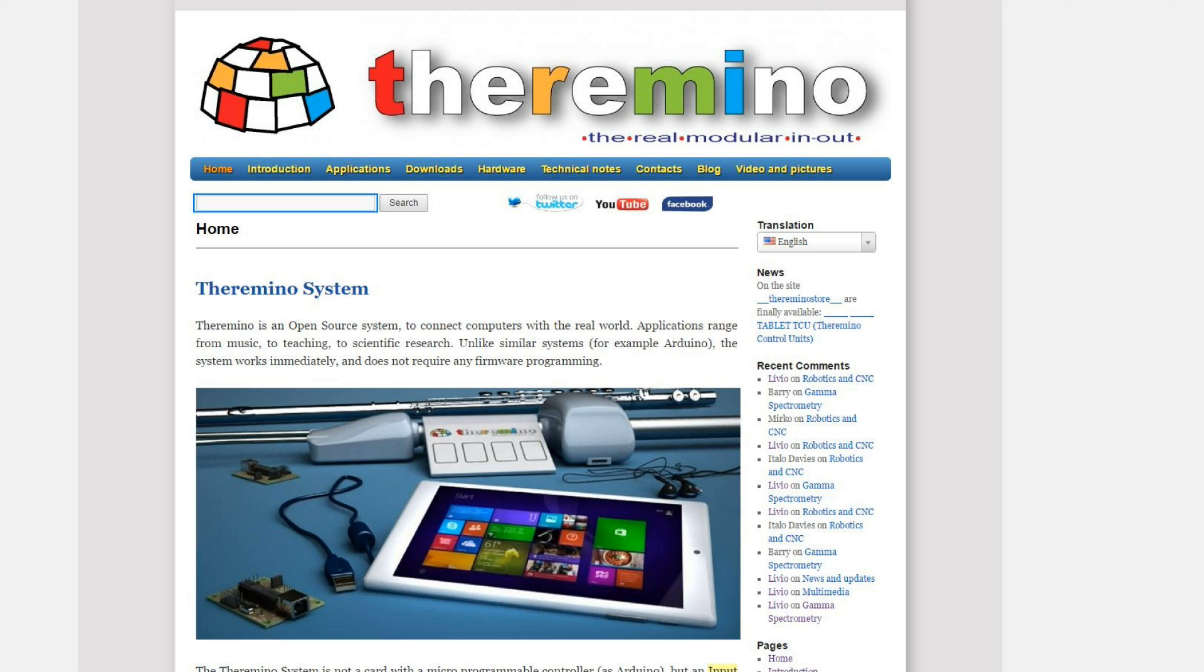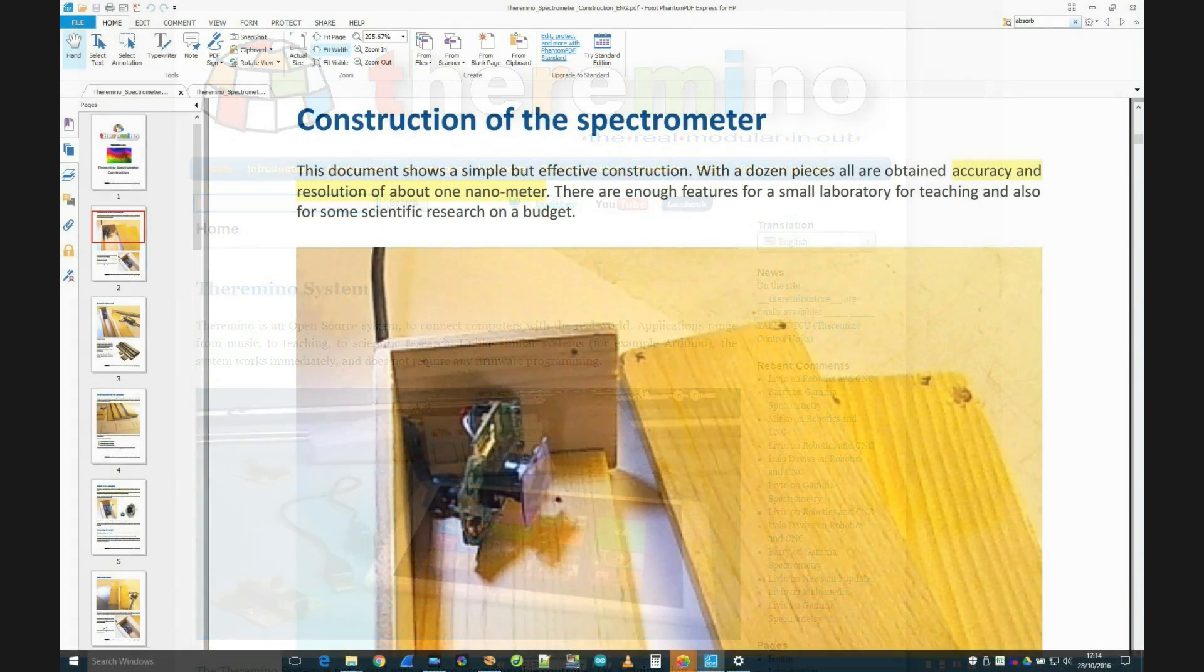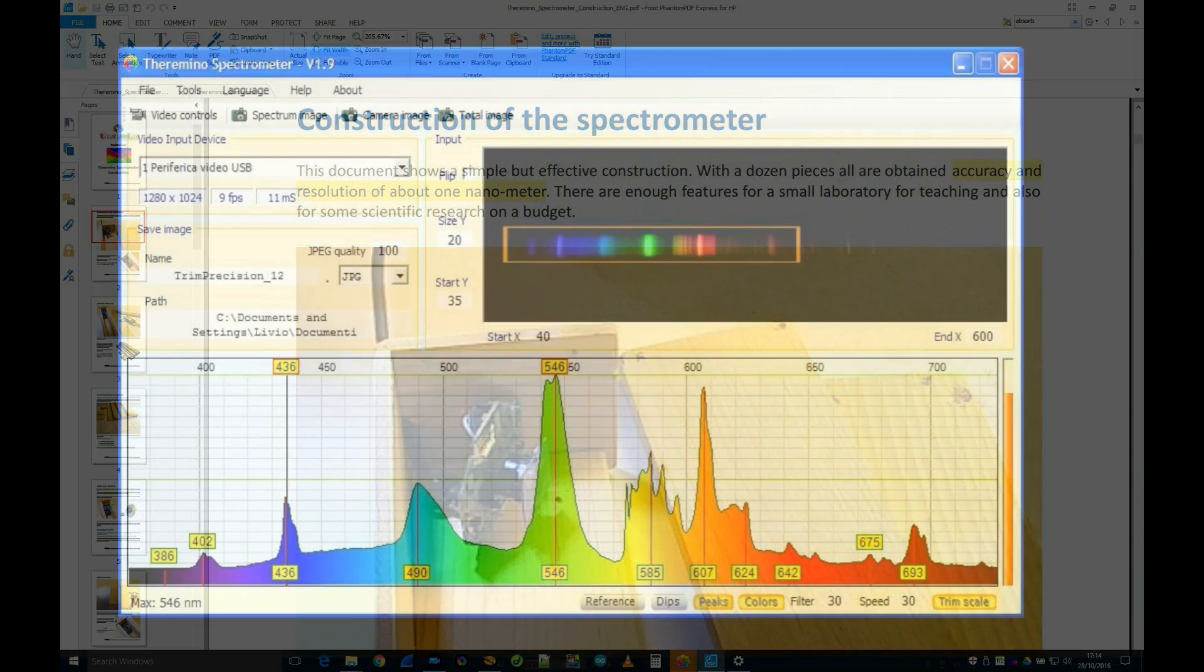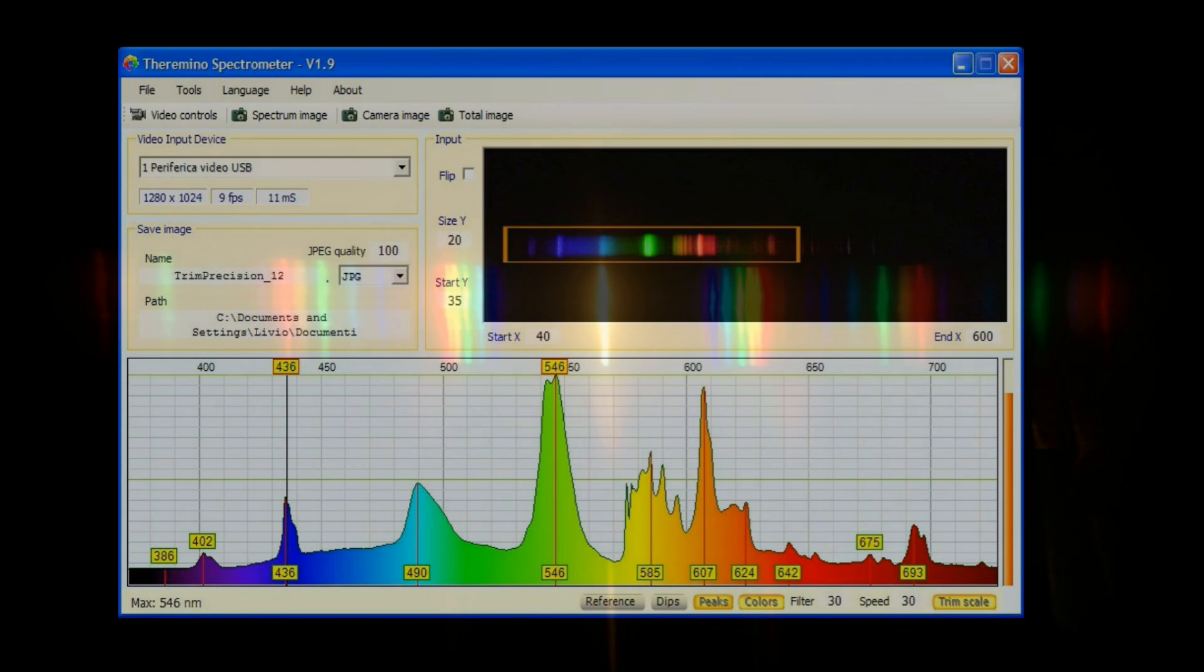In that website, they give instructions on how to build a spectrometer, and they give away free a piece of software which enables you to analyze the spectra which are delivered from the webcam as images into your PC. So it takes those images and analyzes them, so you've really got for not much outlay and not much effort a very usable spectrometer.